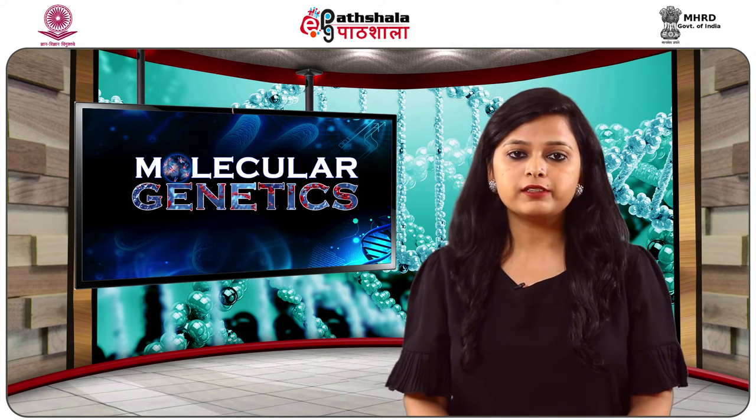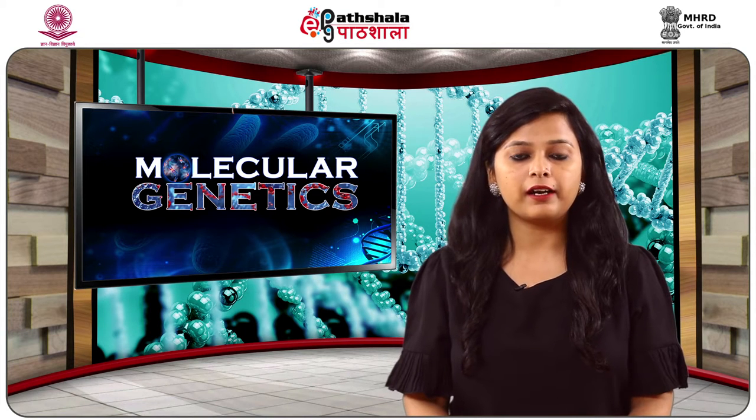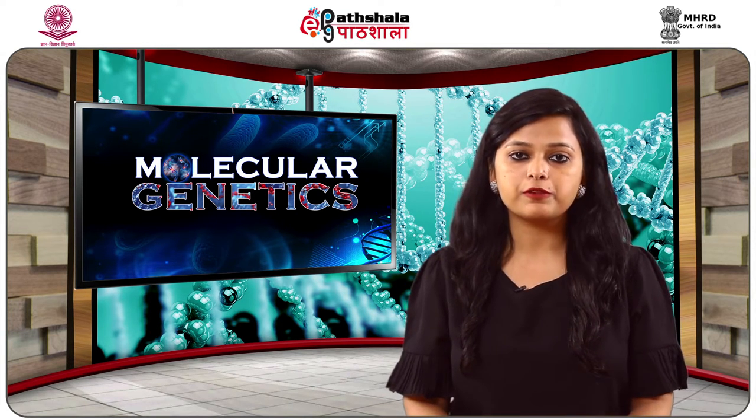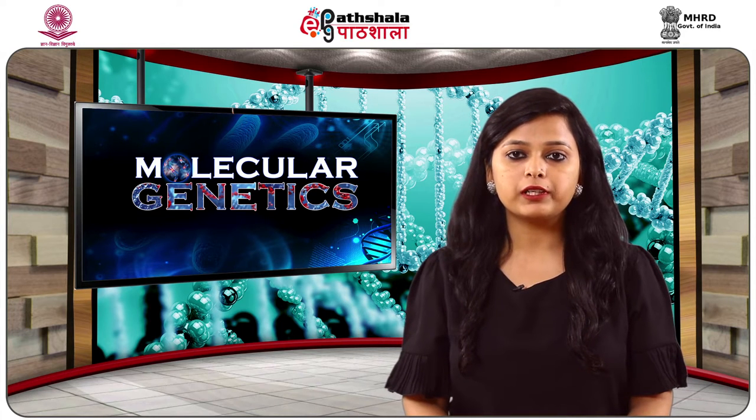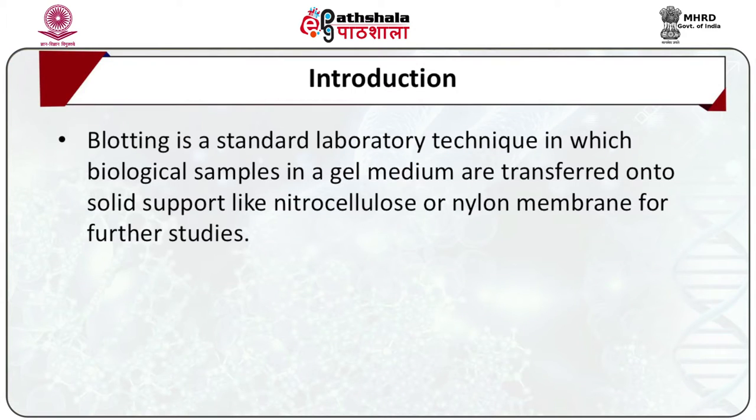After studying this module, you shall be able to learn and understand the basic protocol steps followed for southern hybridization, the various probes utilized and the labeling techniques. In addition, the diverse set of applications will be discussed in brief. So let's talk about what is blotting.